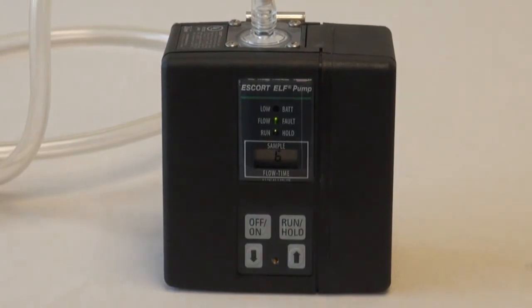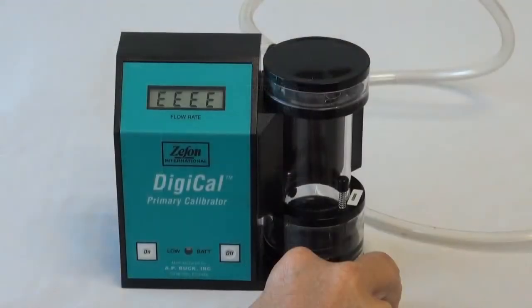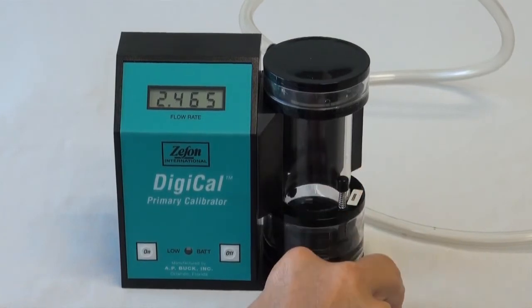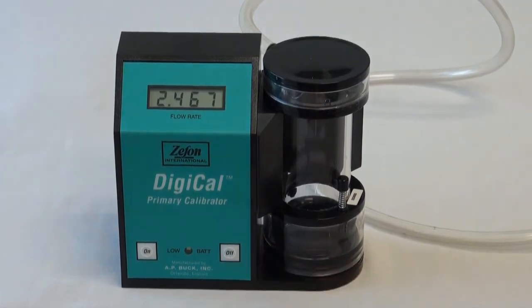After the countdown, the LCD will alternately display CAL and 2.5 liters per minute. Operate the primary calibrator as directed by the manufacturer's instructions. Obtain at least six readings which are very close to one another. In this video, we have an average reading of 2.46 liters per minute according to the primary calibrator.